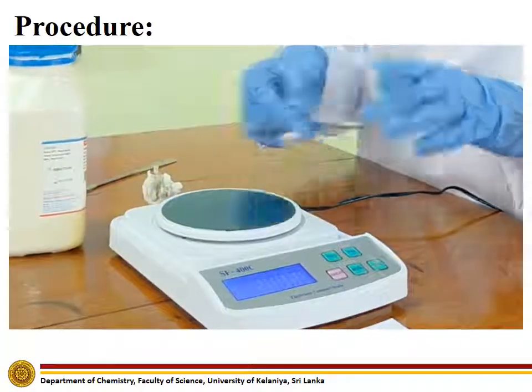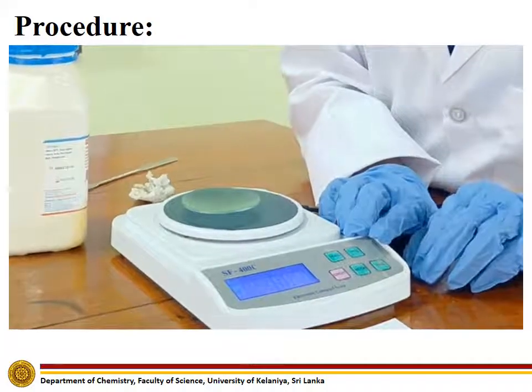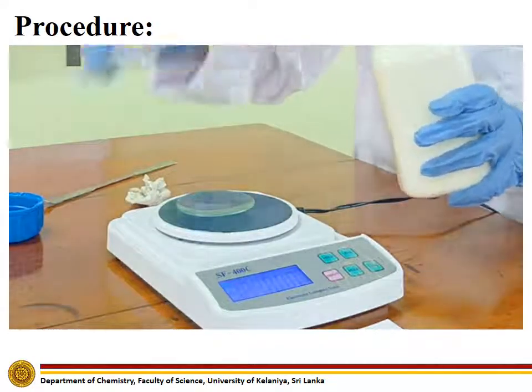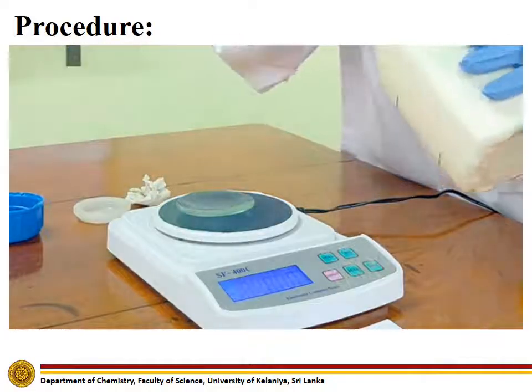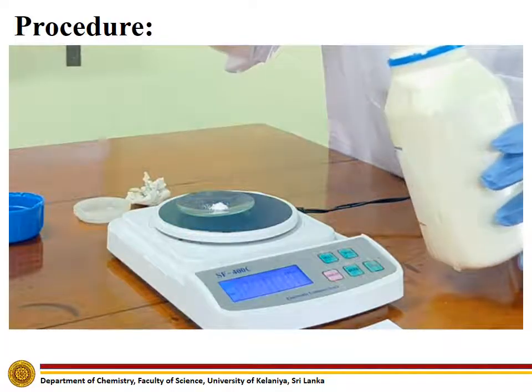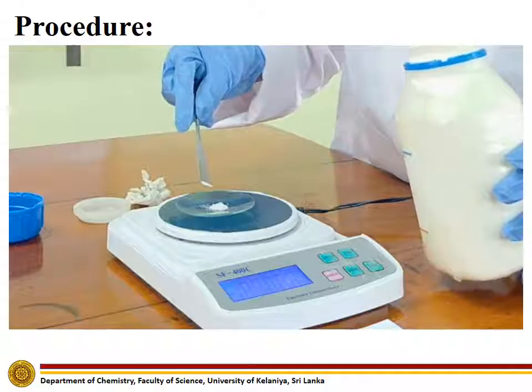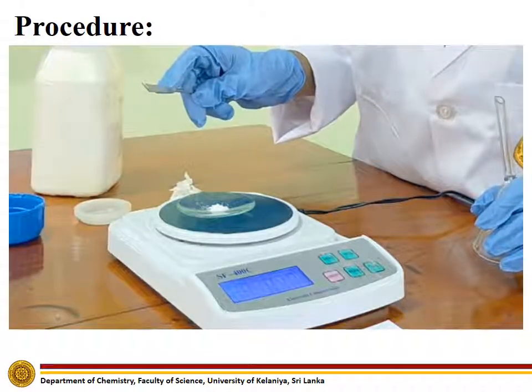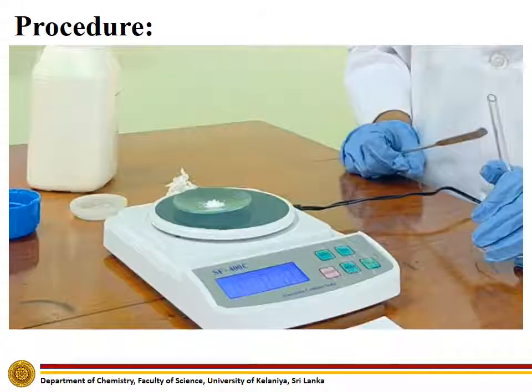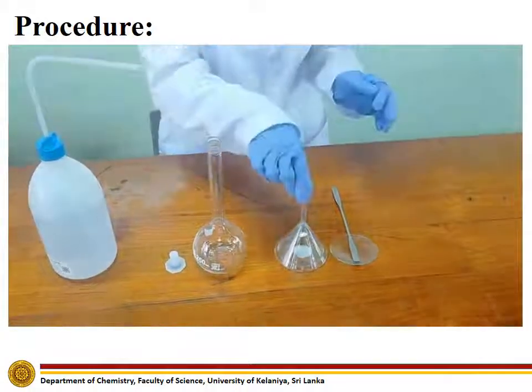First, place a well-cleaned watch glass on the electronic scale and make the reading of the scale zero. Weigh accurately a 0.2 gram sample of sodium carbonate. Using the measured sodium carbonate solid, prepare the sodium carbonate solution.